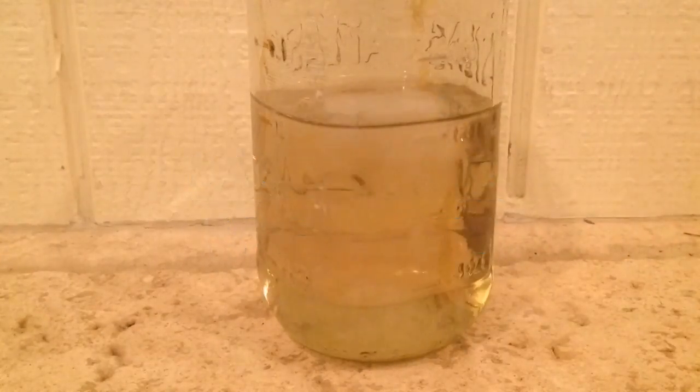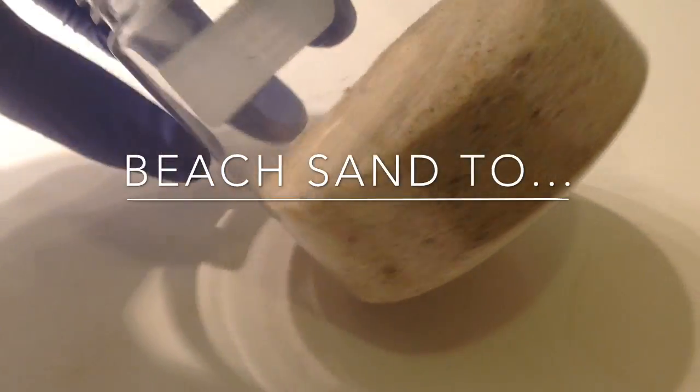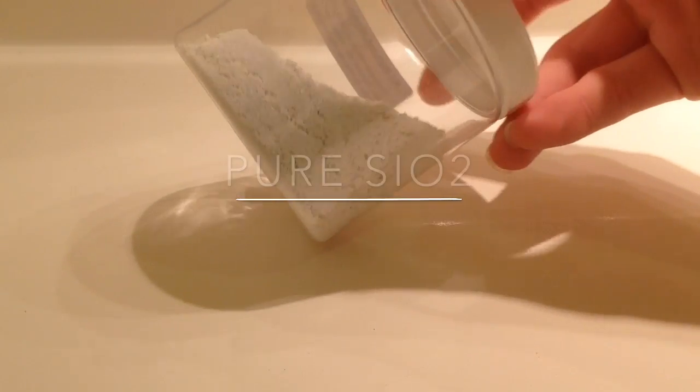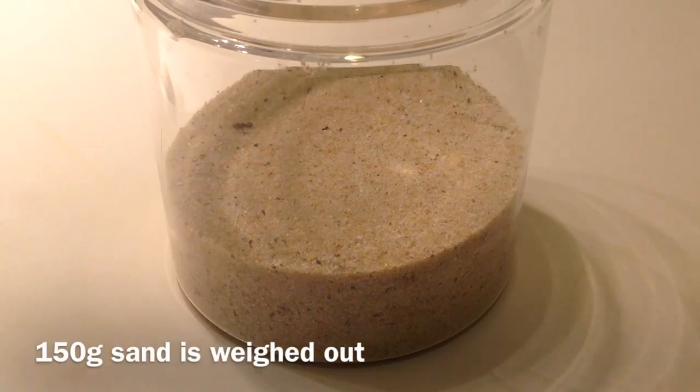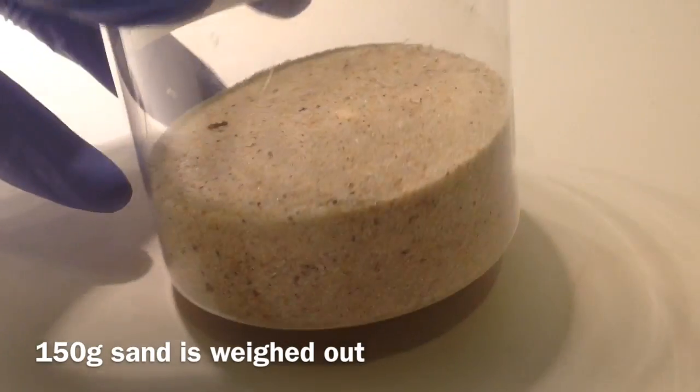BakMakSci presents: turning beach sand into pure silicon dioxide. We start with 150 grams of sand.